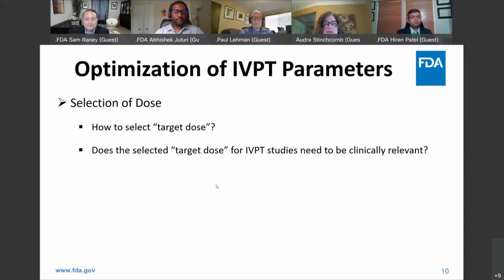So I think that 5 to 15 range is certainly something that's doable reproducibly. I have seen people use much more than that, and if it takes a really long time for your semi-solid formulation to evaporate, that might not be as representative as you would want for that kind of study.